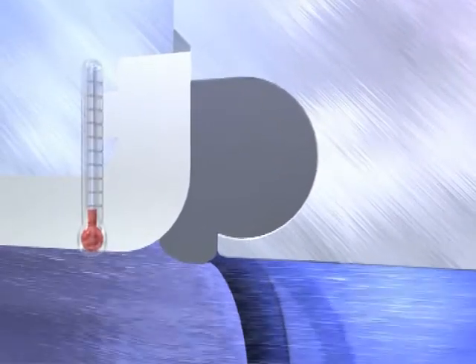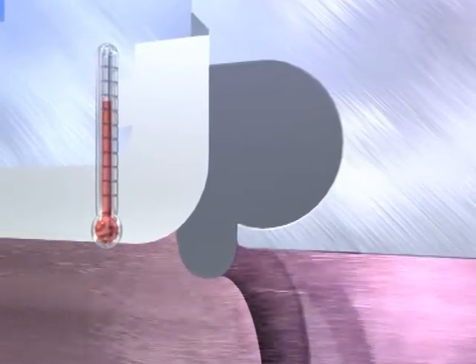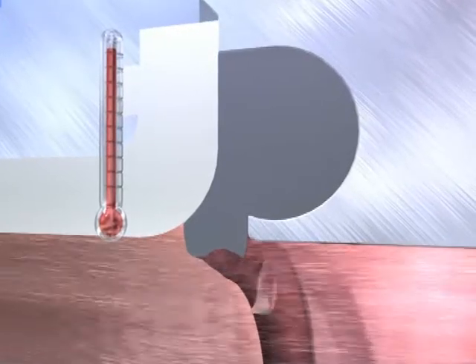Conventional O-rings are chambered, so CIP and SIP cause the ring to expand and push into the pipeline, rubbing across the edge of the pipe flange. Within a short time, the ring becomes damaged, both through abrasion from the flange and from the medium in the flow tube.